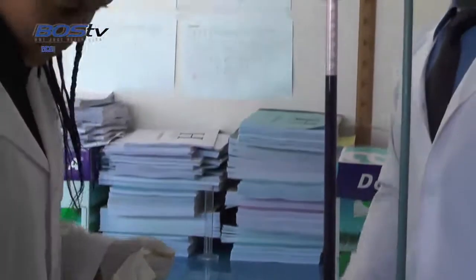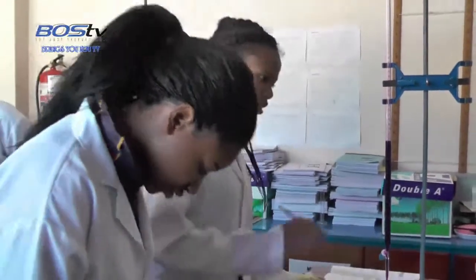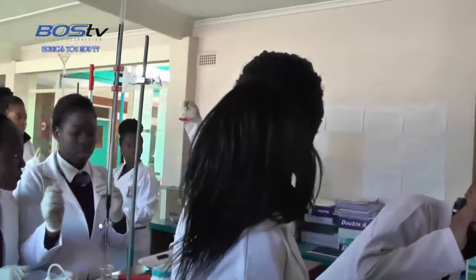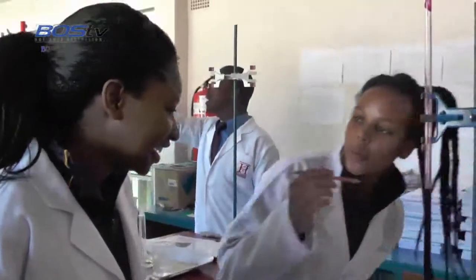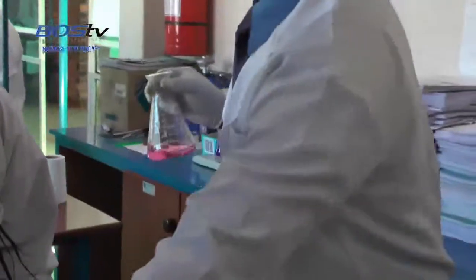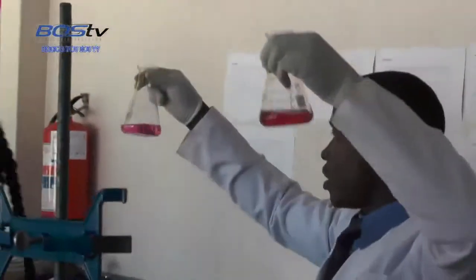Do it clockwise. Don't act like you are pouring into something. Okay, this is your faint colour that I'm expecting at your end point. It should be faint, not dark. If you see it darkening, it means you've already overshot the end point. If you compare these two colours, this one is inaccurate, this one is more accurate.